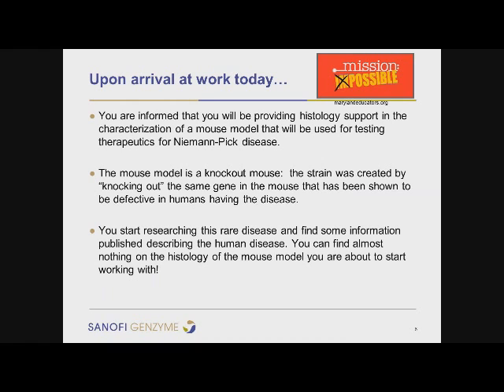So, like we said, we're going to go through this from the point where we received our quote-unquote missions all the way to the end when we have glass slides. We're going to go back a few years, and upon my arrival at work that day, I was informed that I'd be providing histology support in the characterization of a mouse model that's going to be used for testing therapeutics for Niemann-Pick disease.